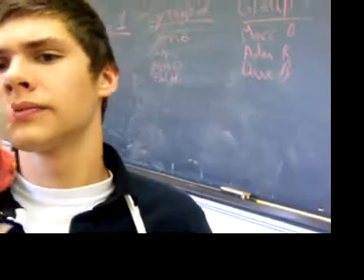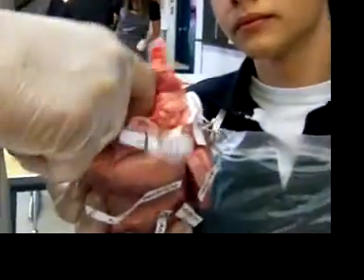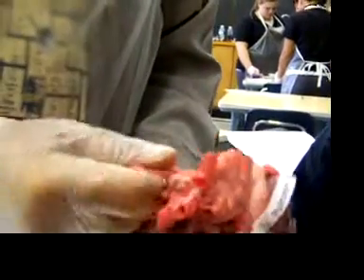Is that hole right there? It is still there. I see how it goes in there — I just thought it would be different tissue, kind of cartilage-like. And then if you follow it through, you should be able to find the inferior. But we really don't want to duck our pins in.